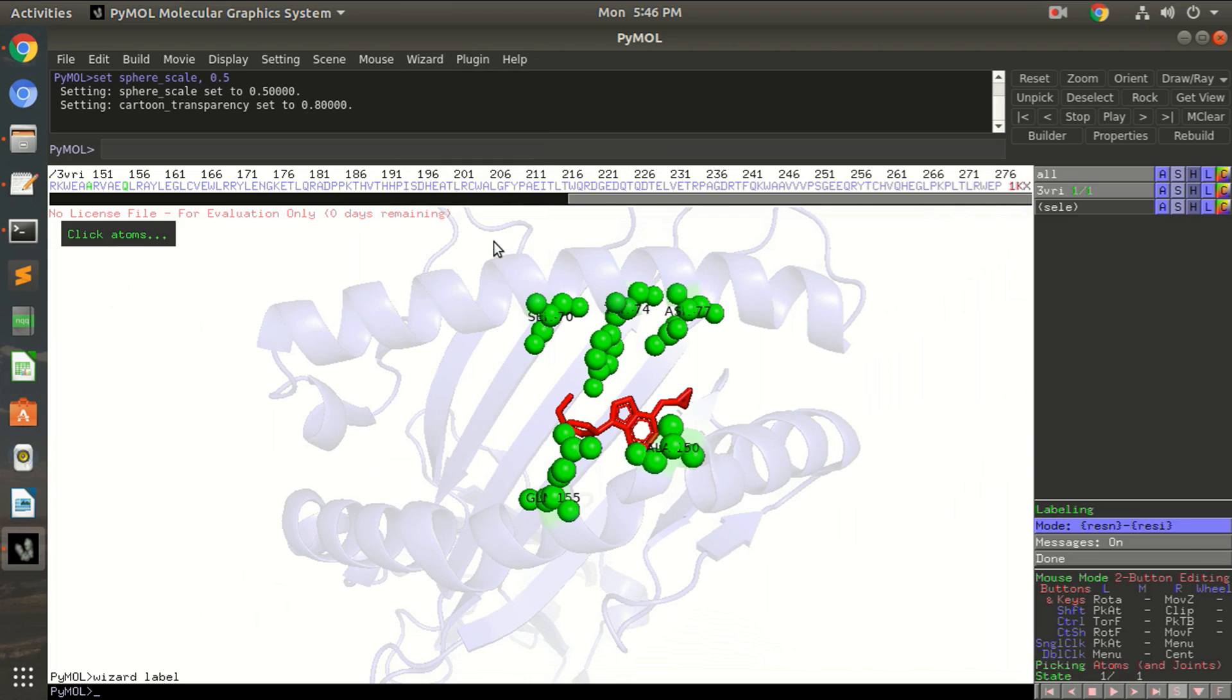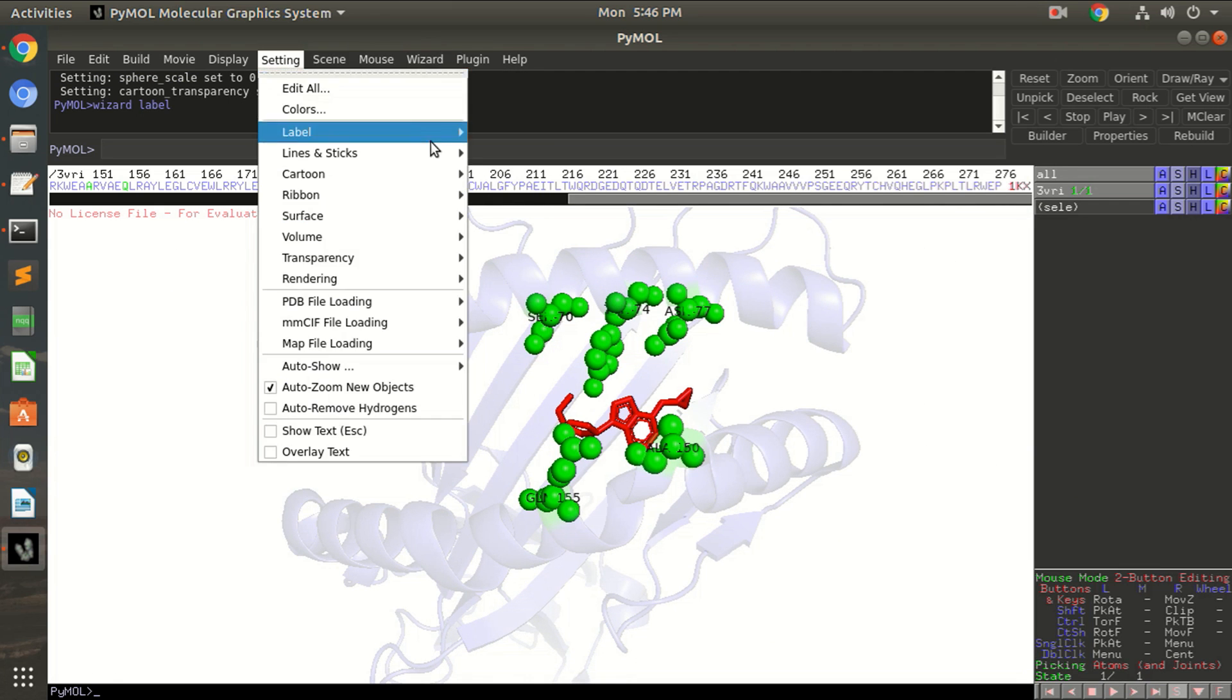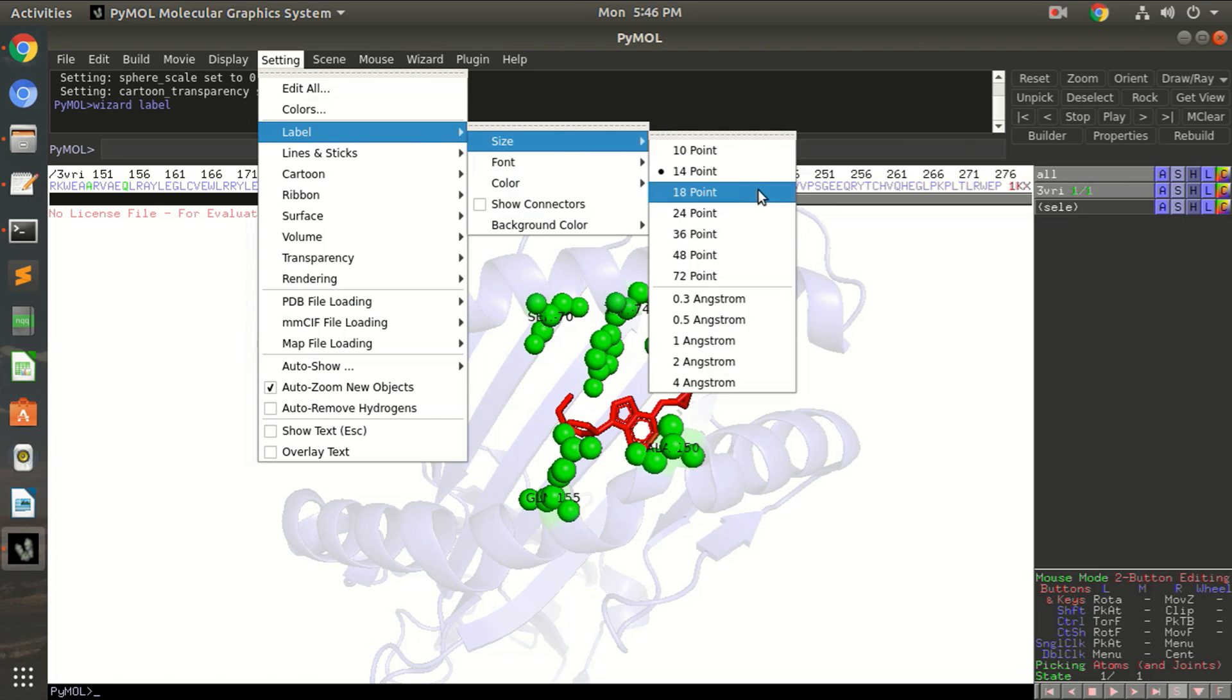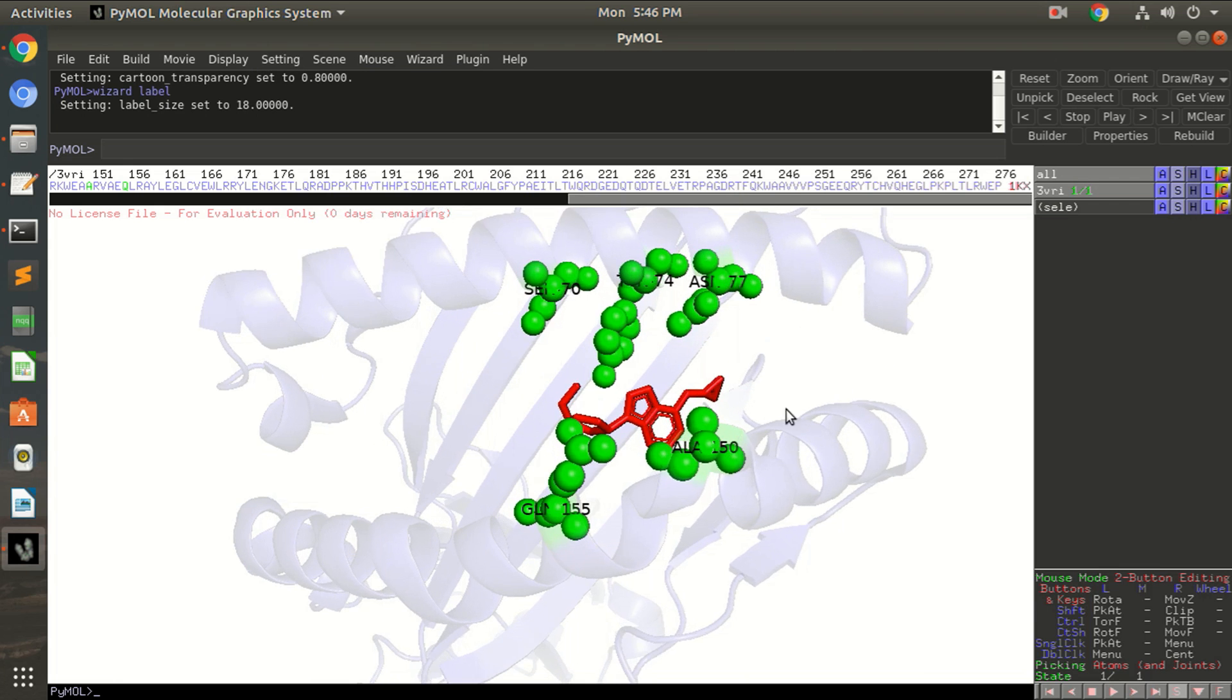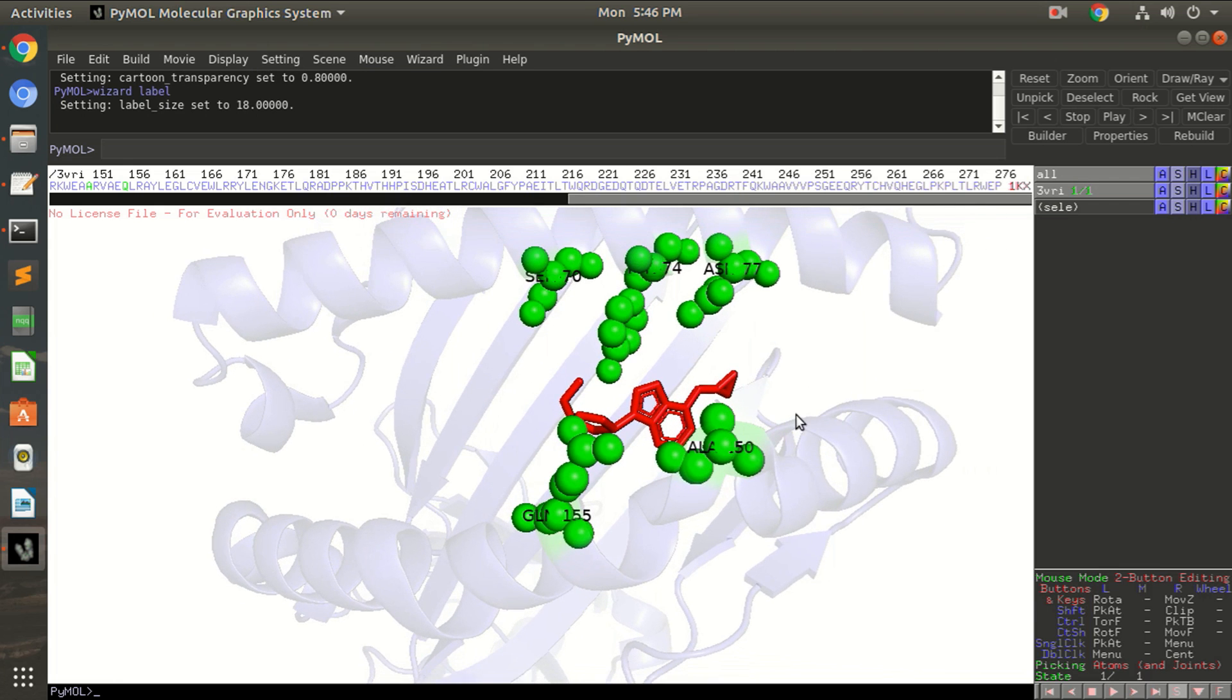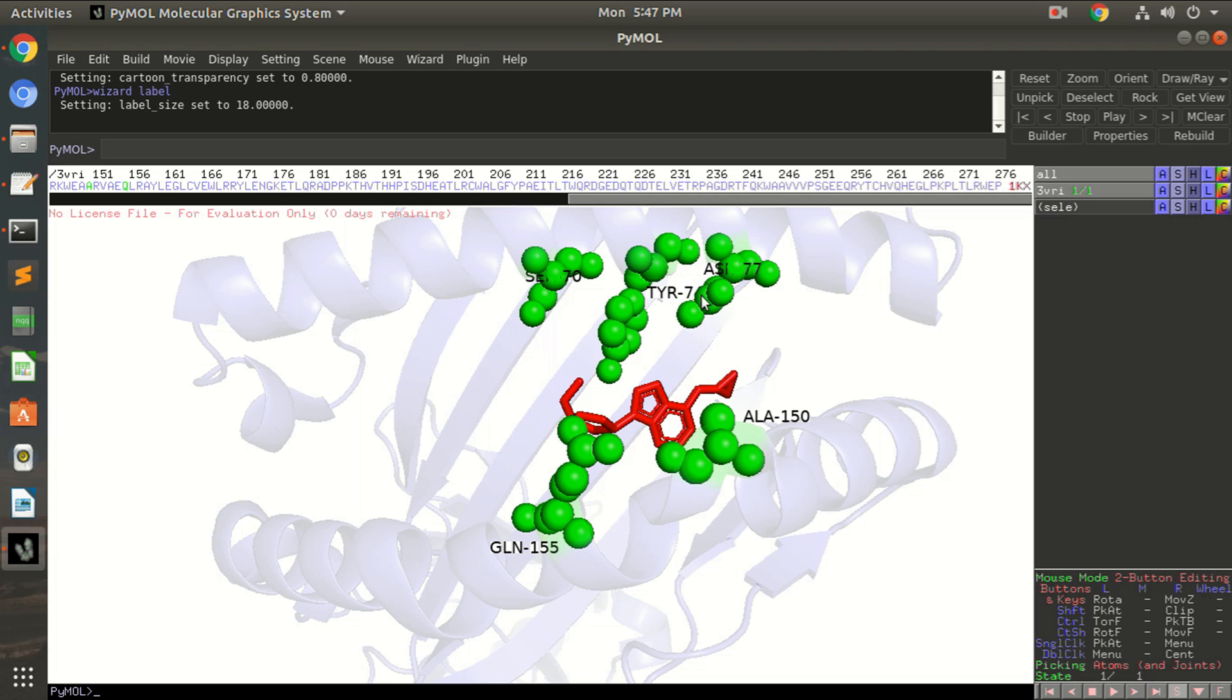All right, now be very careful. Let's first increase the size of this label, set it to 18 points. Okay, now you can see them clearly and we are in the editing mode so carefully press control button on your keyboard and click on this residue name. Again carefully click on the residue name only, otherwise it will move the protein or your sphere as you can see here.